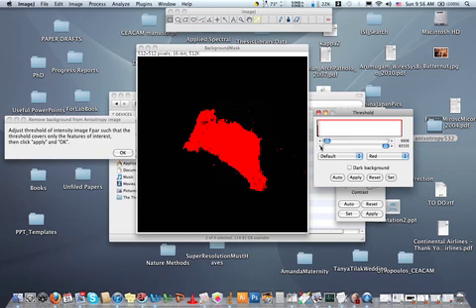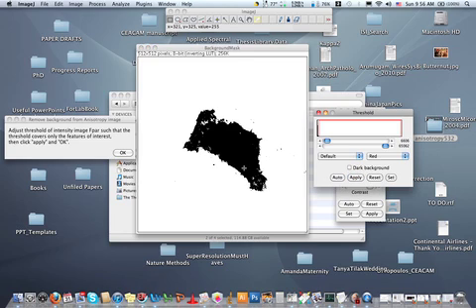If you've collected images and you have saturated pixels, just knock this down once or twice. There you can see a few white pixels right there. Those are saturated pixels. So we've excluded the background, we've excluded saturated pixels. Click apply on the threshold window, voila, and then click OK over here.